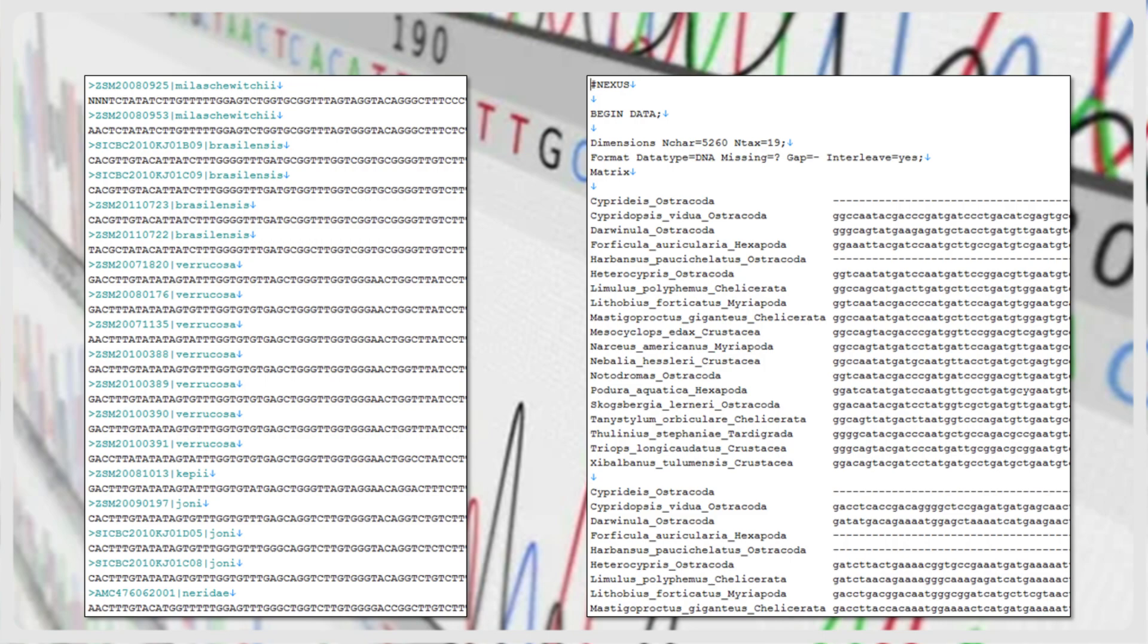There may also be sequences from a few additional loci, for example, an organellar locus such as mitochondrial CO1, plus a few nuclear-encoded loci. Once quality control of the chromatograms has been completed, the sequences will usually be available in FASTA format, or perhaps in other formats such as PHYLIP or NEXUS.